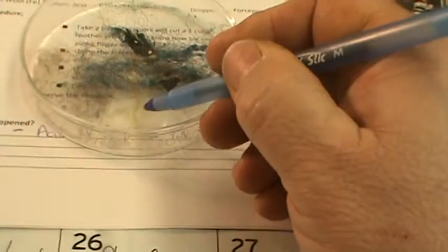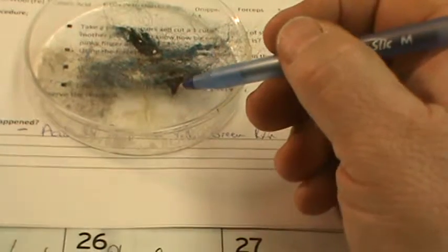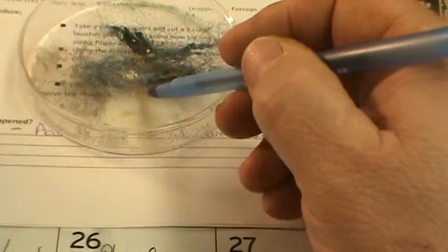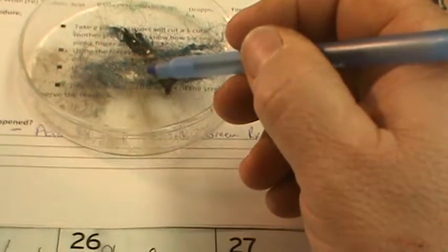Then I wanted to know what would happen if we just put the acid on the steel wool. I'm soaking that pretty good, and really all I can see with my eyes is some streaking in the acid. I assume the streaking is partly whatever steel, iron, is being taken away in the acid, and also remnants of the soap.